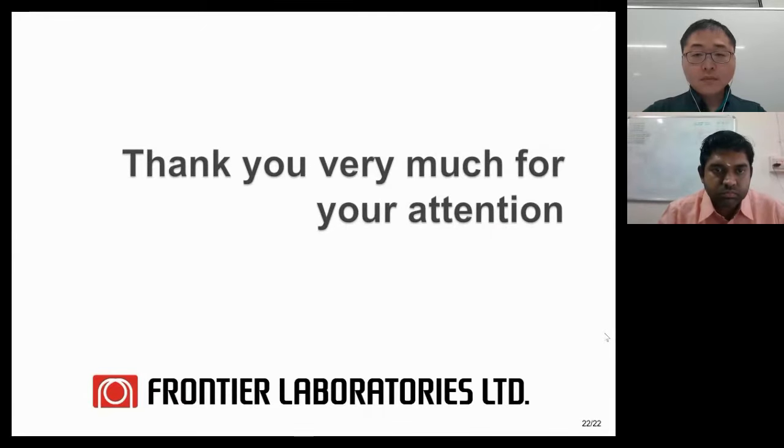The last message is that when environmental samples are pyrolyzed and the data are searched by the software, you need to keep in mind that search results are telling you the types of polymers. For instance, if the search result tells polystyrene is contained, that means your sample contains polystyrenic materials. It may not be polystyrene only. Although the software assists the interpretation of your data, it will be important to keep that in mind to draw your conclusion. Thank you very much for your attention.